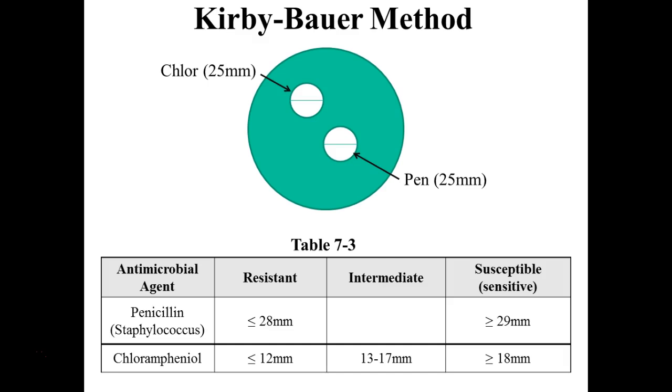Would you give that to your patient? No. So the chloramphenicol, though, that one has to be 18 or greater. So is it susceptible to chloramphenicol? Yeah, because it's 25, which is greater than 18.